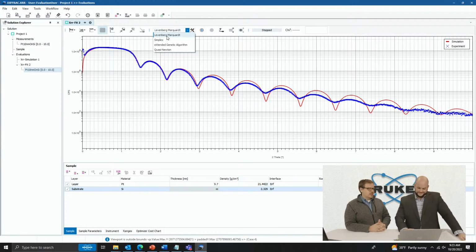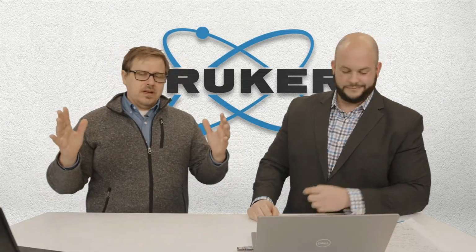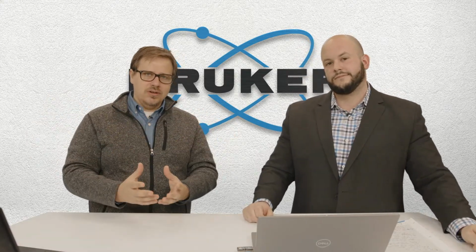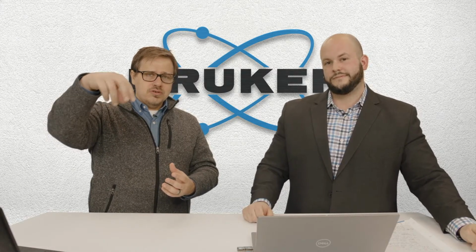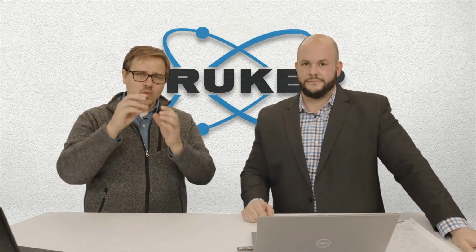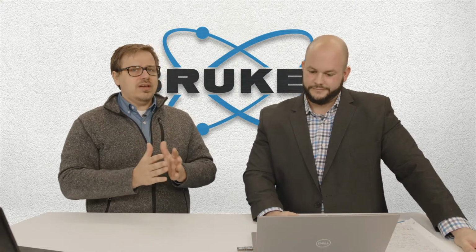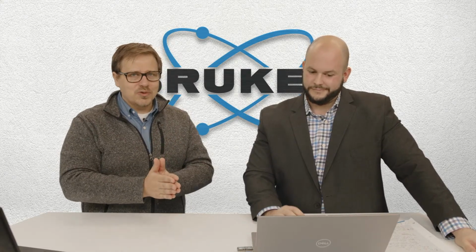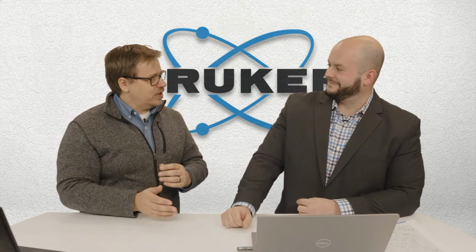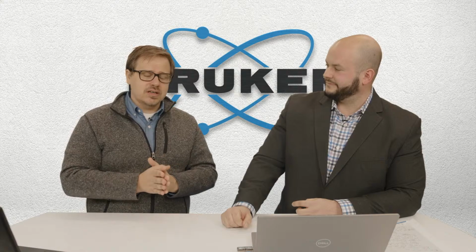Yeah, the way I like to think about it is that the first two methods, the Levenberg method and the simplex method, take your current state. Imagine being on that plane with two variables, and you have these local minima and then the global. Simplex and Levenberg take your current location on that error space and try to refine it. They find the lowest error relative to that starting point. So it's very localized. If you're in a local minimum, this is just going to make that fit better, but on the wrong answer, unfortunately. But if you are in the global minimum, this is very efficient at getting you the right solution. This is really going to give you the best finish, the best data there.